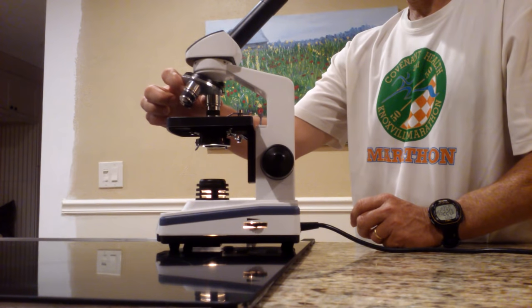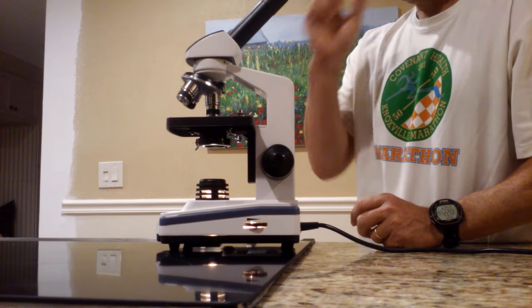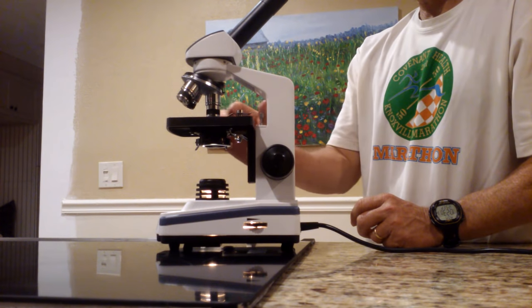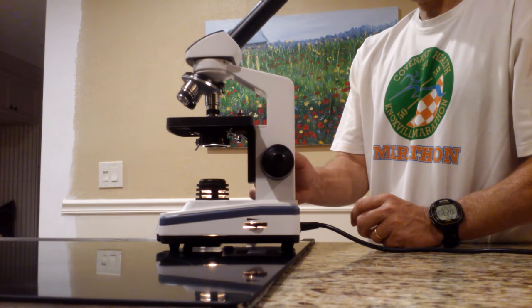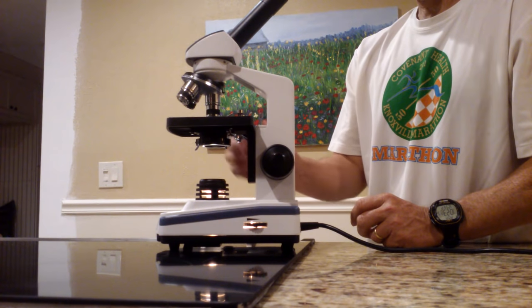When you move to high power you will notice that the objective lens gets really, really close to the slide. Just be careful — if you use the coarse adjustment on high power, you risk crushing the slide.